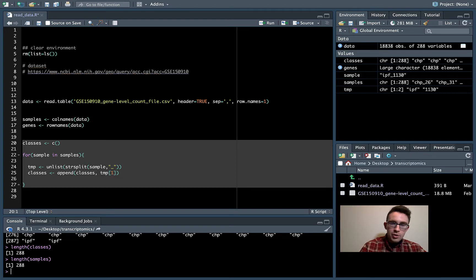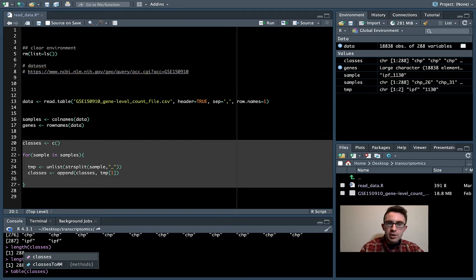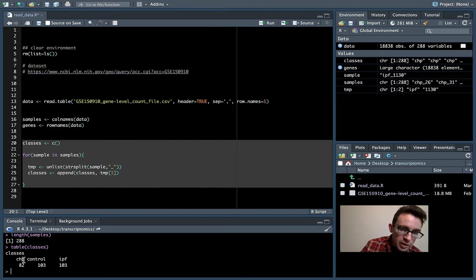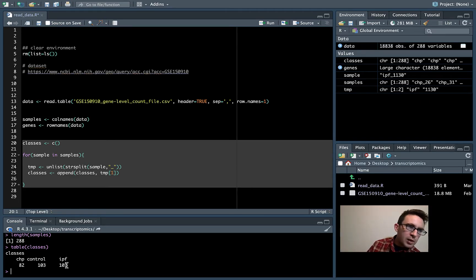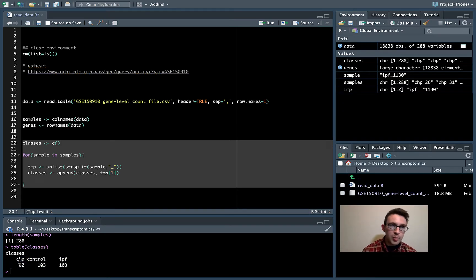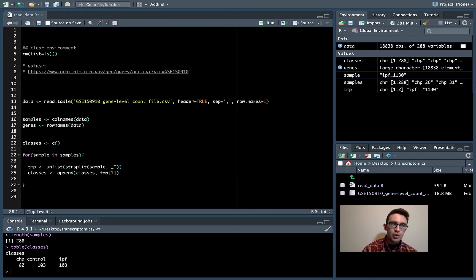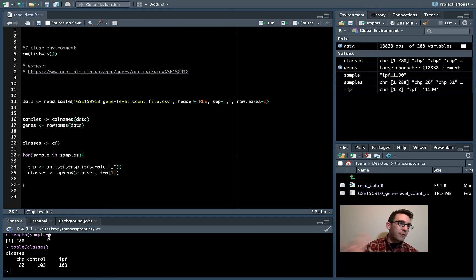We can confirm the classes vector is the same length as the samples vector. We can also run table(classes) to see how many samples we have per class: CHP has 82 samples, control has 103, and IPF has 103. This matches what was described on the GEO website, so everything looks correct. The next step is to filter out the CHP samples since this series focuses on comparing IPF lung tissue to control lung tissue.